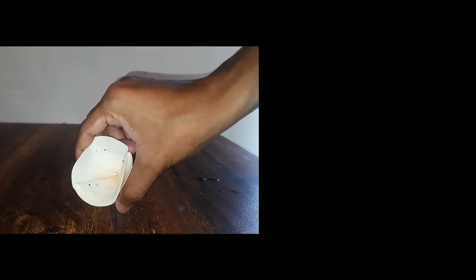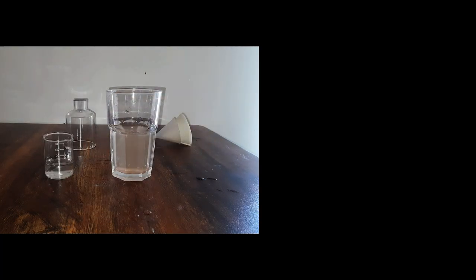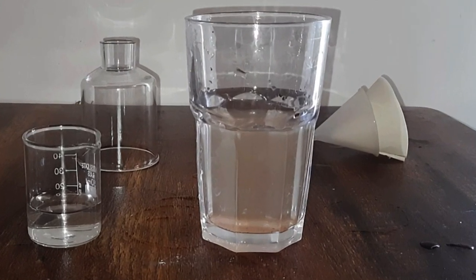All the sand is collected in the filter paper, and you get much clearer water. It might still have very small sand particles present, but the majority have been filtered out.